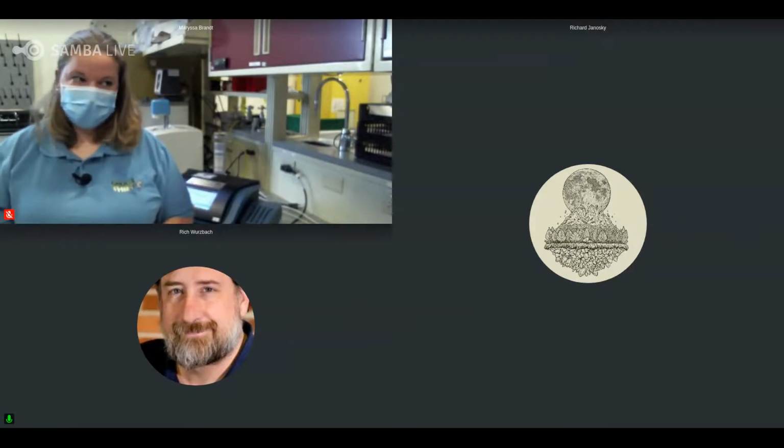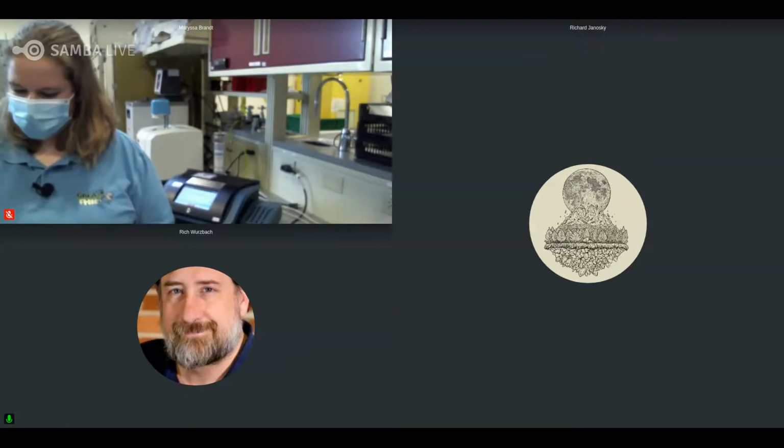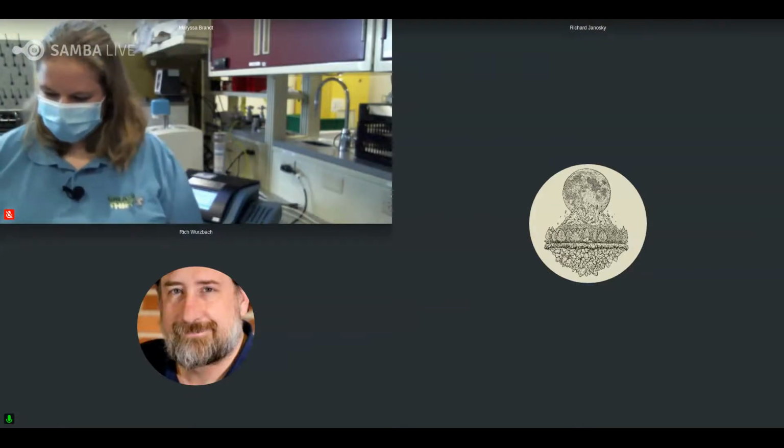To David Turner's question, which was, is there concern about water from the sample being carried out with the purge? That would be part of the way in which it's set up, the purge time, the purge cycle, and then the temperature of the testing of the grease to make sure that that doesn't happen, correct?